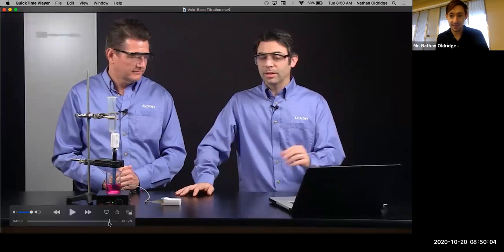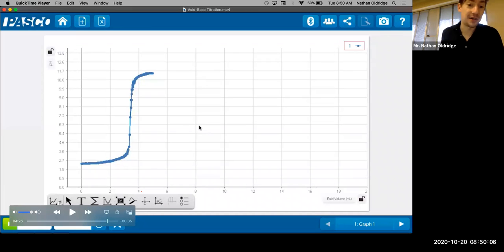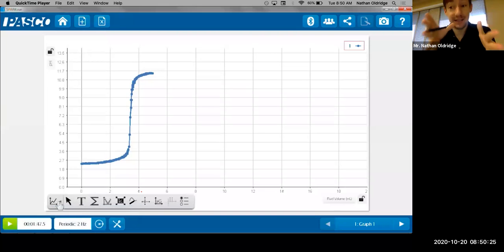No, they're just going to emphasize that this is also a nice titration curve. You're starting with a strong acid. You neutralize it and blast through the pH of 7, where we expect the equivalence point to be. You, as a chemist, would stop at probably about here, just past the equivalence point at what we call the end point. The end point ends up being different from the equivalence point because you're waiting for the pink color to stay.